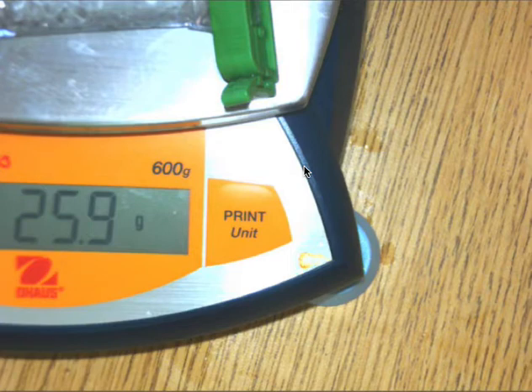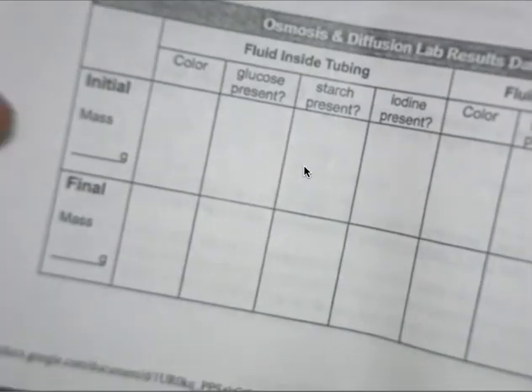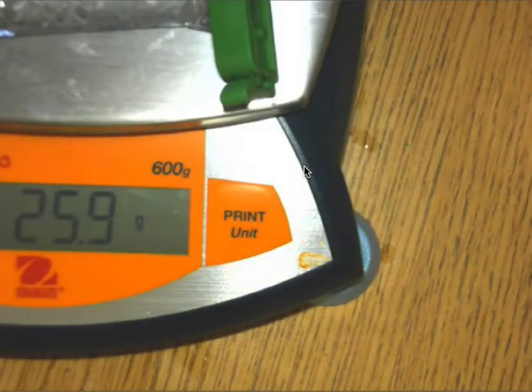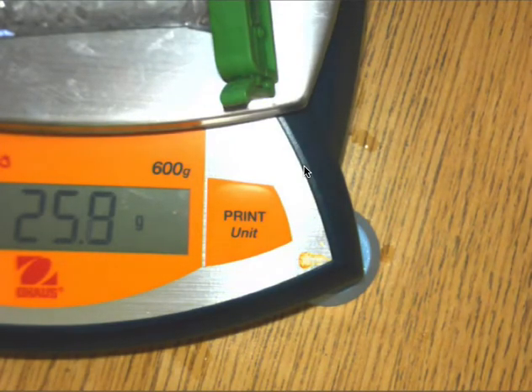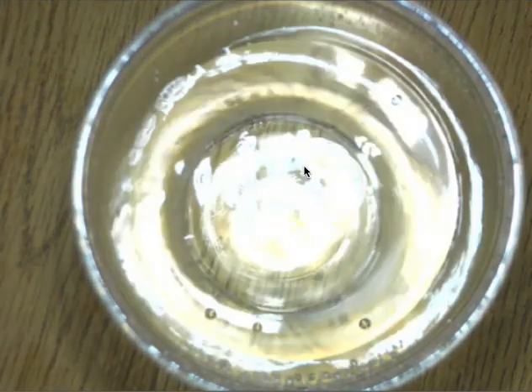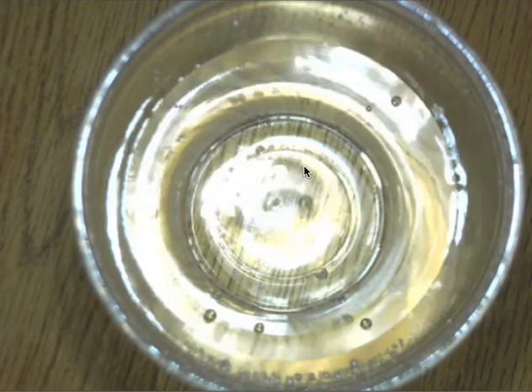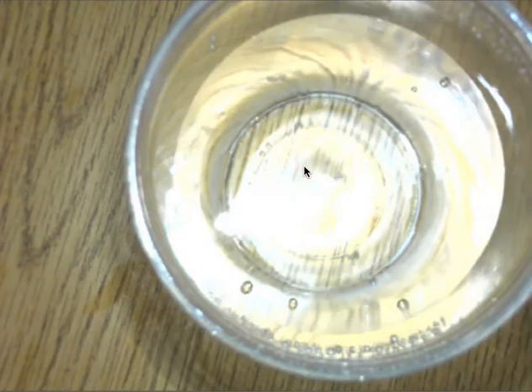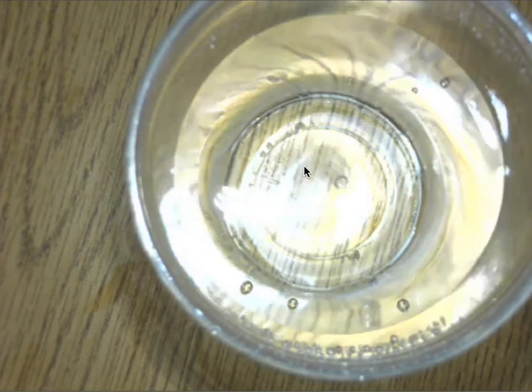So now we're going to take that to the chart that we have here, where it says initial mass, we're going to put in our 25.9 grams. Now we're going to move this over. Now, here's our cup of water. There we go. Okay. And now it says we've patted it down. Place the tubing in a cup of tap water. It must be completely under.